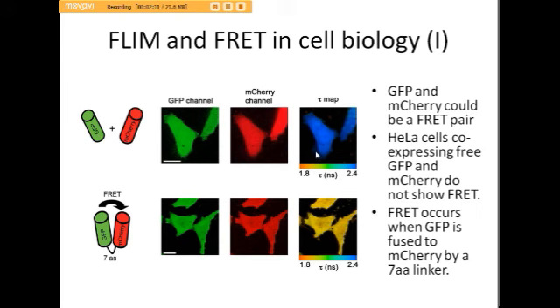So we can use FLIM to measure the fluorescence lifetime. There is a microscope specifically designed for FLIM, and we're not going to cover its operating principle here. Here is a FLIM map, which is usually color coded, for example as a heat map.